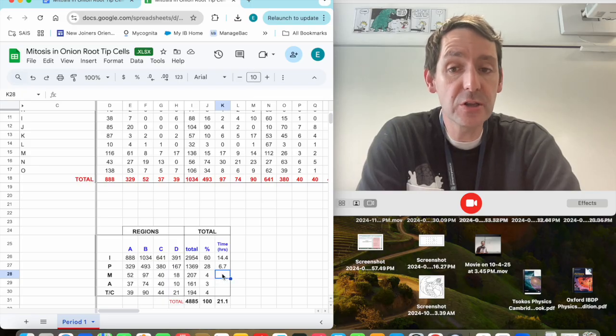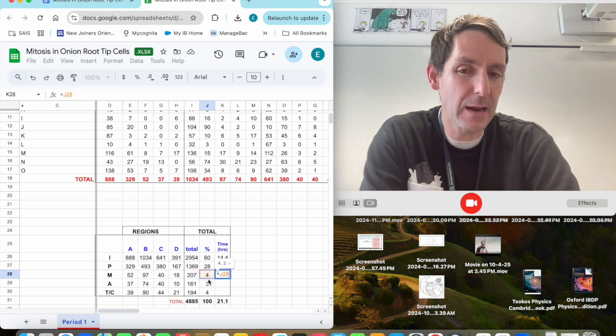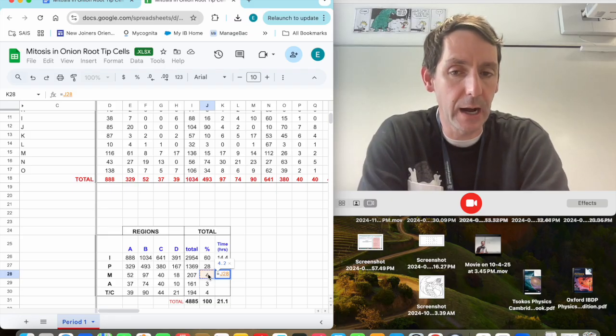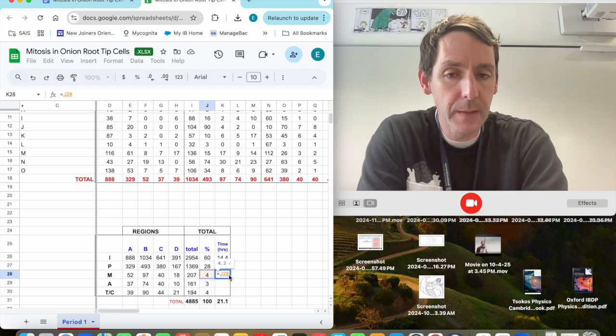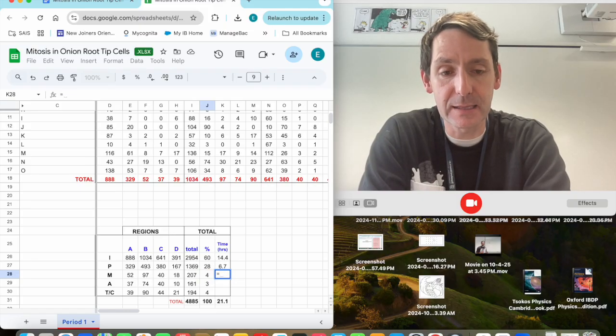All right, so I should then be able to go through and answer the rest of these. Note that I am doing this based off my spreadsheet automatically rounded my percent to a whole number. If you use the actual values, you might get something slightly different here.